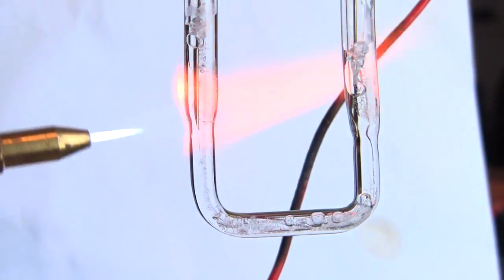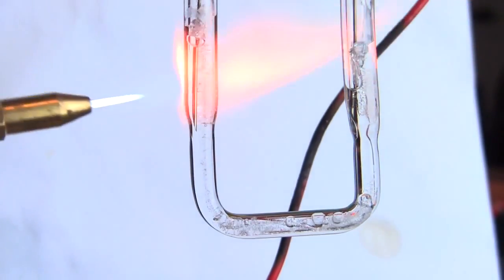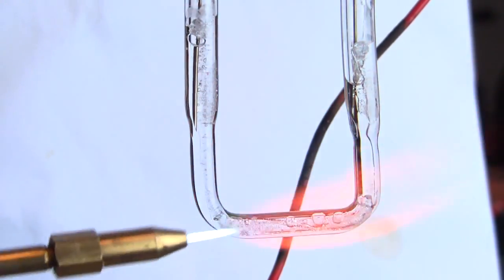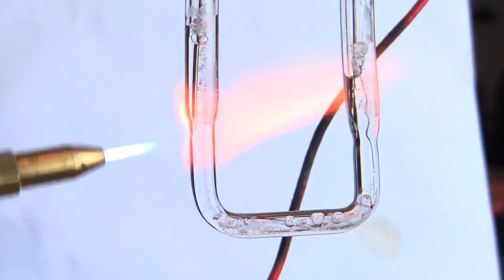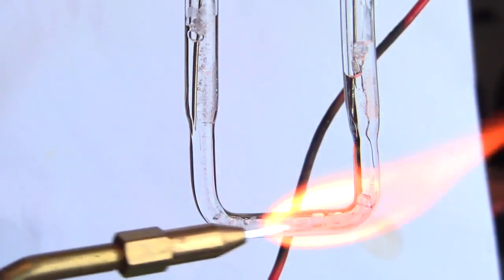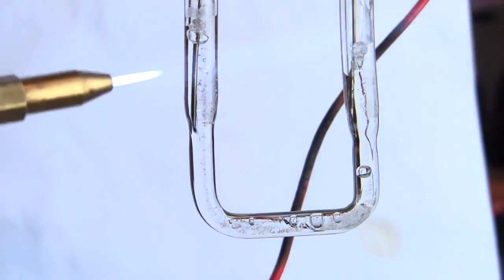That's why it's all done in this little U-tube thing. And there is the slight problem that the difference in temperature between when this stuff melts, which is about 600, 700 degrees, and when the glass softens, which is only a couple of hundred degrees higher than that, is kind of tricky with something as small.